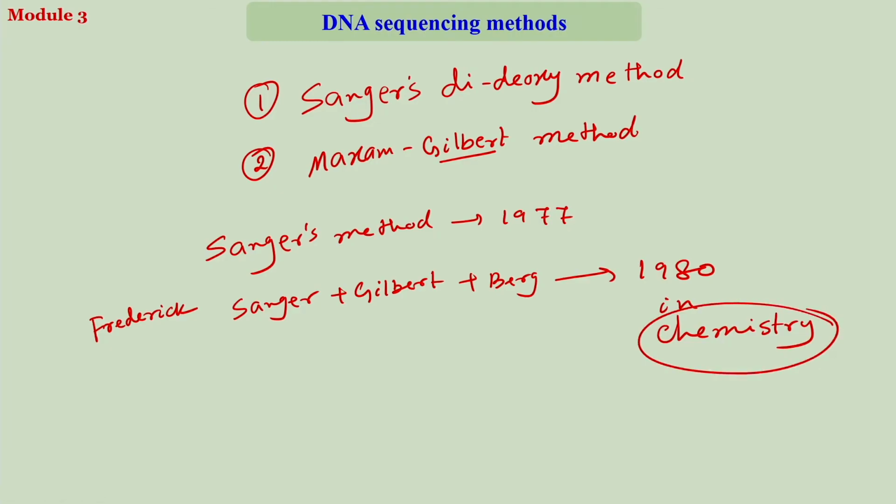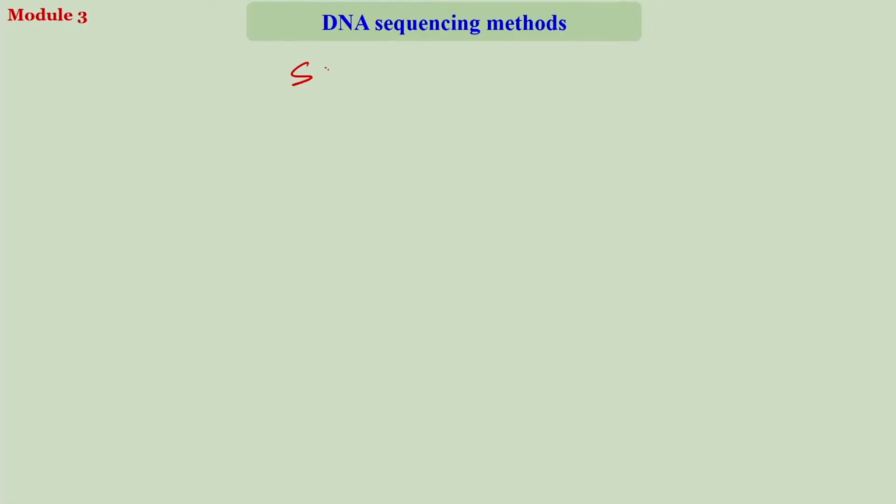So, you can see the enormous contribution chemistry has in biology or in understanding the biological molecules. So, we will start with Sanger's di-deoxy method.